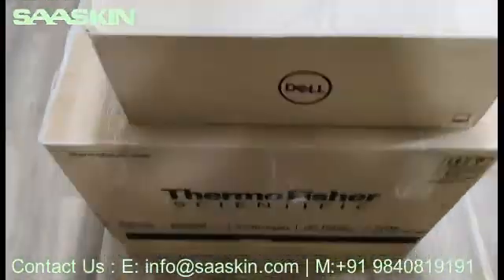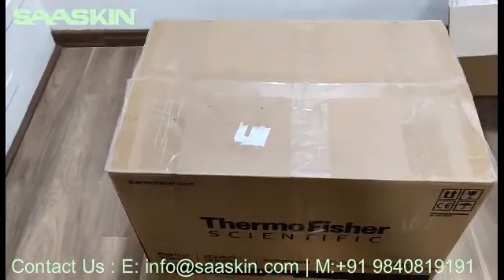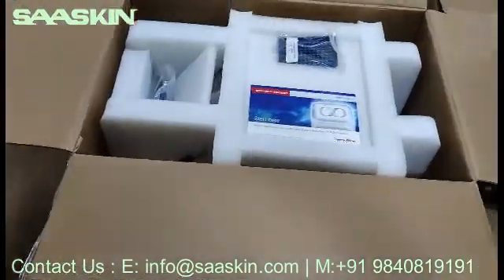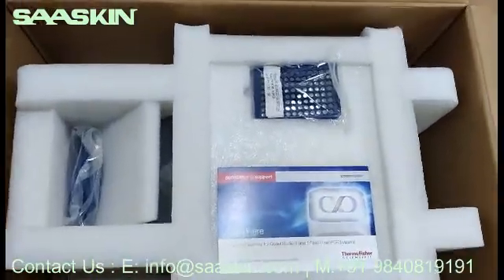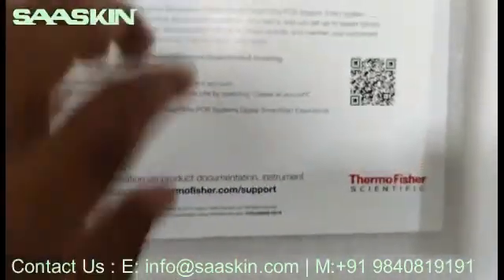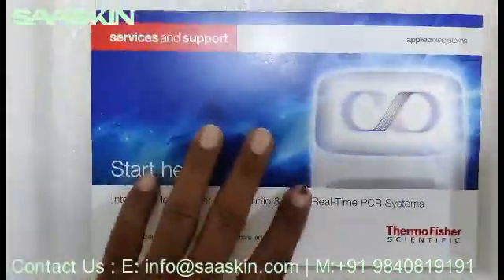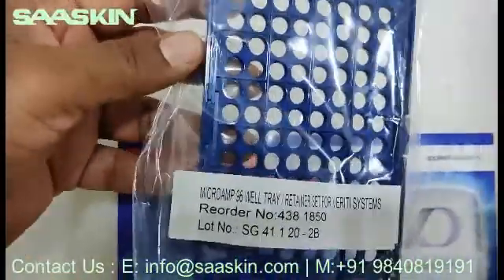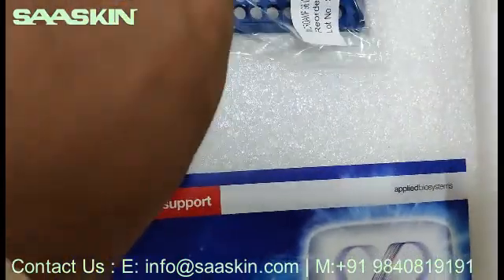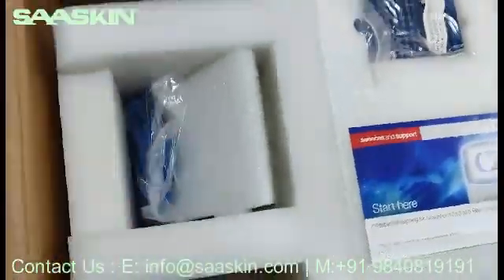Let me introduce the contents of this box. First, I will move the accessory box aside and open the main box. This is the inside content. There is a service and support manual — you can go through that, create your own login, and follow for your service support. And then there is a tray — you get a 96-well tray. And you have a connecting cable between the instrument and the system.